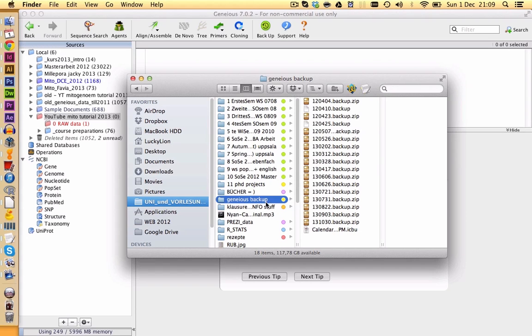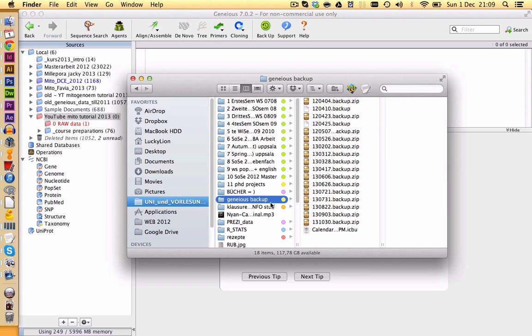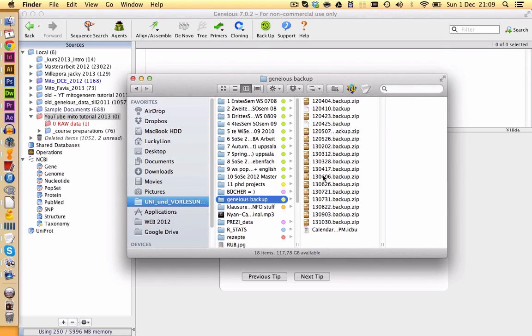I have for example, all my backups stored in my folder for university. Of course, you only need to make backups if you change a lot of your data. If you're not working with Genius for a few months, you don't need to make backups. But it's a good thing to have also some old backups in case you delete something and you figure out a few weeks later, oh, you shouldn't have deleted those things and you need to get them back.